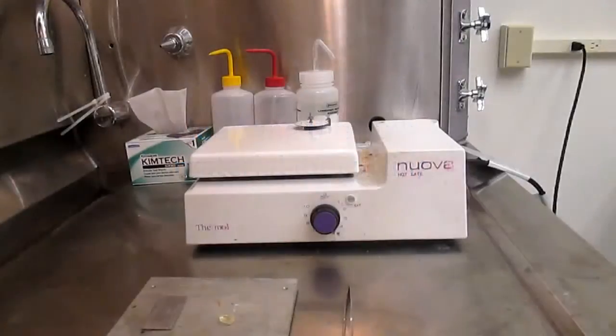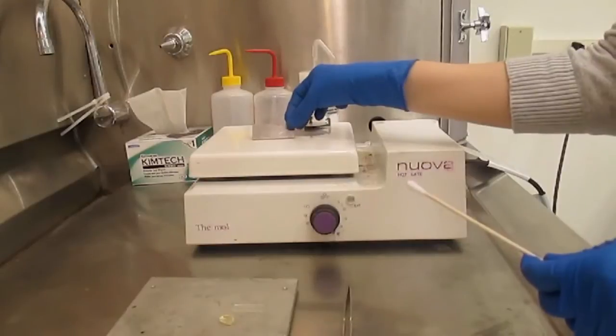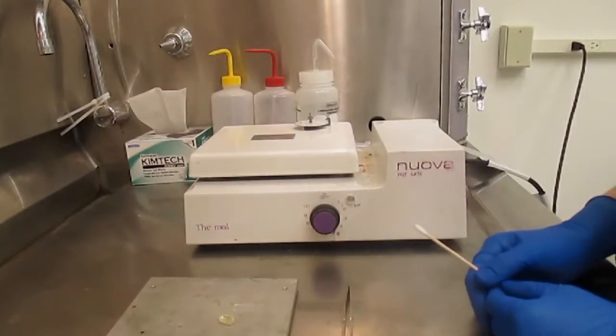Mounting the bulk material for cutting. Place the aluminum specimen plate on a hot plate heated to approximately 120 degrees Celsius to melt the crystal bond adhesive.